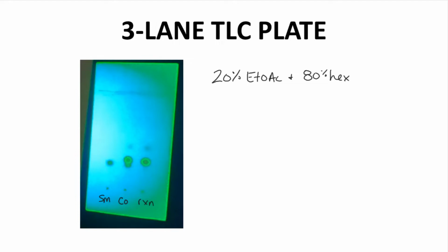What do we see? Well, the starting material has one spot, just starting material. Perfect. The right lane has a new dark spot that should be product. There is another faint spot a bit higher up on the plate. Note that the reaction lane does not have any starting material spot. That's good news. That means that the reaction has completely consumed the starter material. This reaction is indeed complete after 20 minutes of heating.